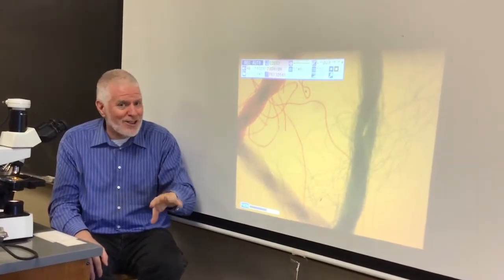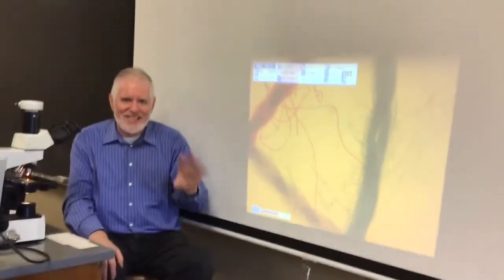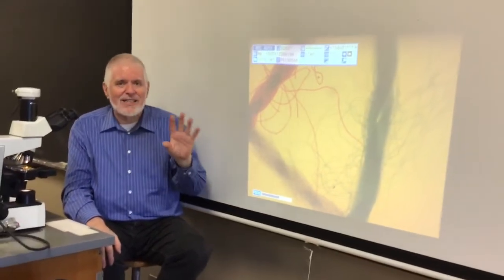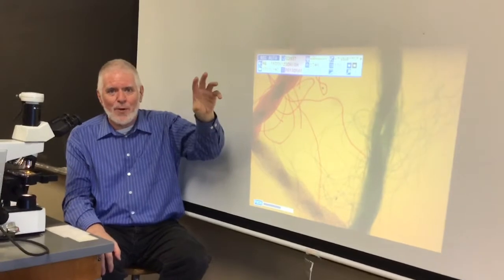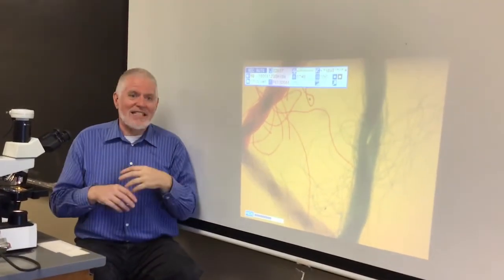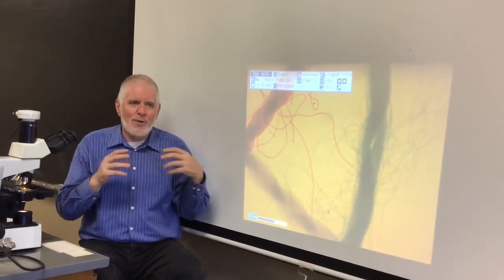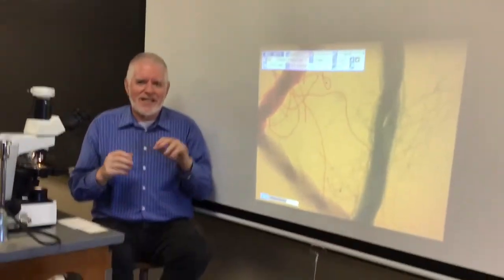If you look at your two drawings, it should be an obvious difference. But it's weird that people look at the drawings and they don't see it. And that is the biggest clue I can give you, that is going to be the issue between what you see for question 1 and what you see for question 2. And question 3, what has changed that has nothing to do with magnification? Okay, I'm going to do these parts separately, so these videos are going to be relatively short. So we're going to stop this now.